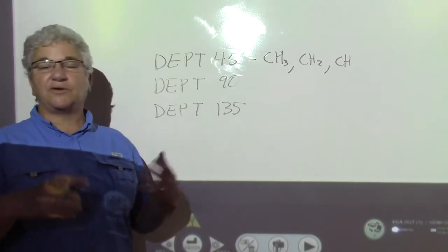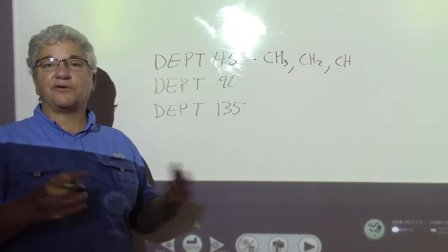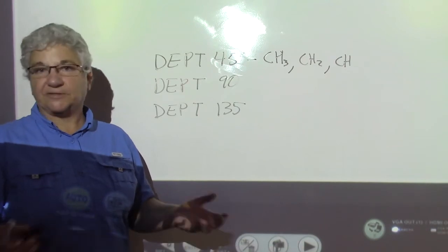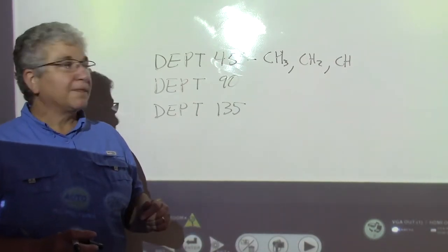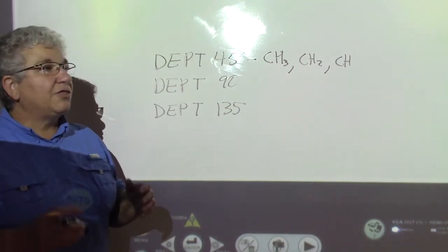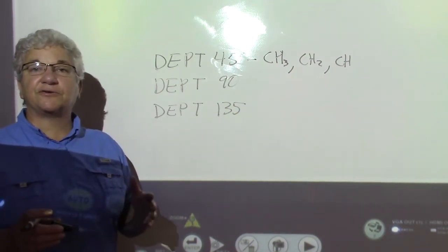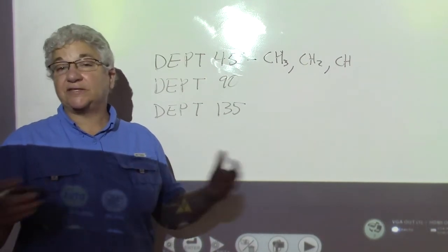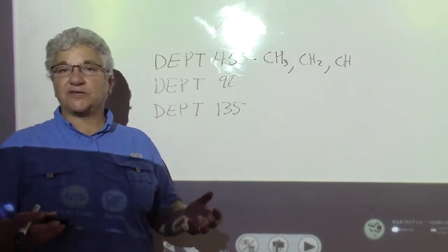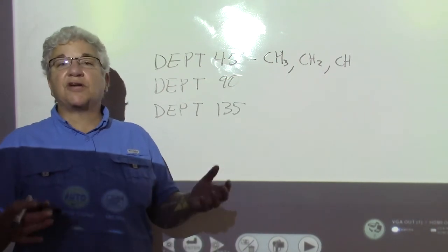That just has to do with all of the theory and the technology that we skipped, rightfully so, to get here, okay? So you have to run a C13 spectrum first, because in a C13 spectrum, if you have carbons that don't have any hydrogens, they'll still show up.